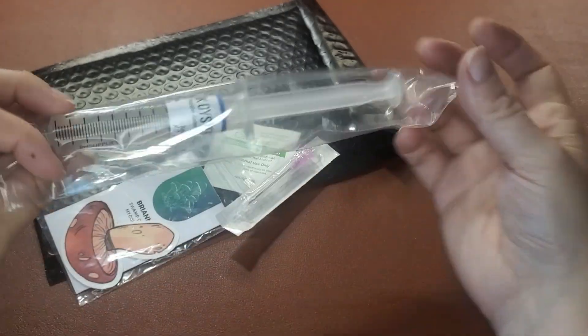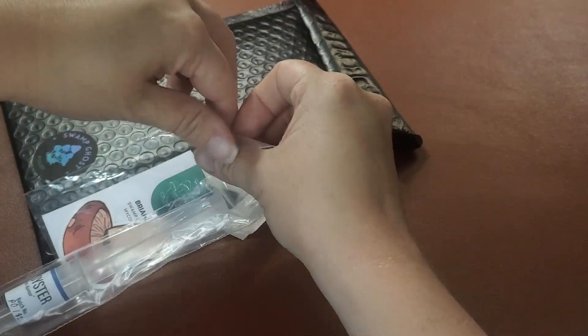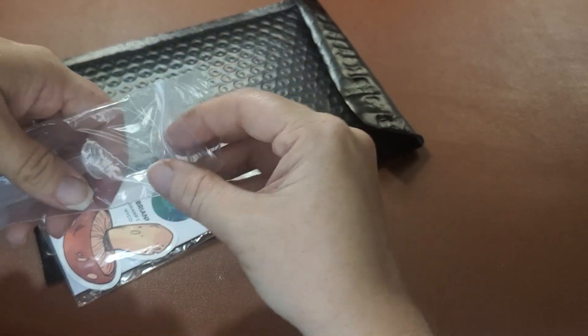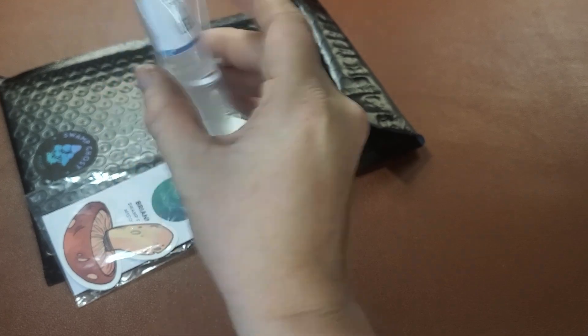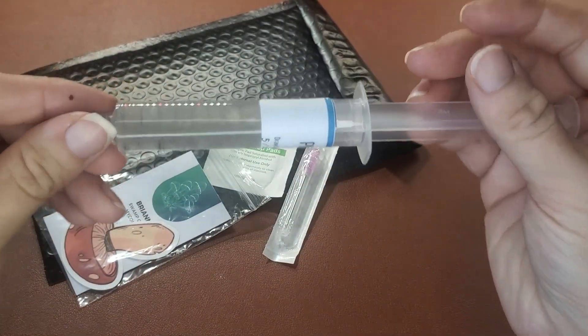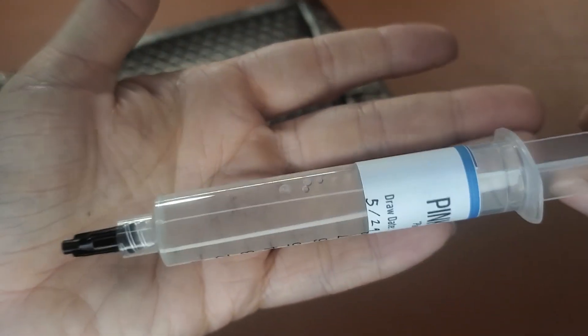Today we're going to be doing a demonstration using this pink oyster genetics. Let's go ahead and pop it open. What I do is just open the side, kind of pinch it open and let it fall out. This is what she looks like. Now let's see if we can get the camera to show you the mycelium that's in there.